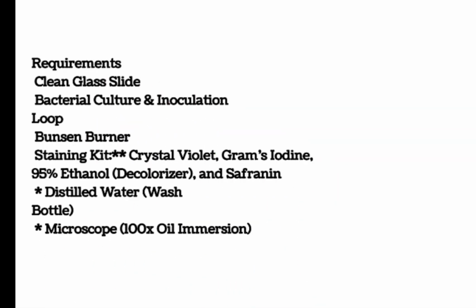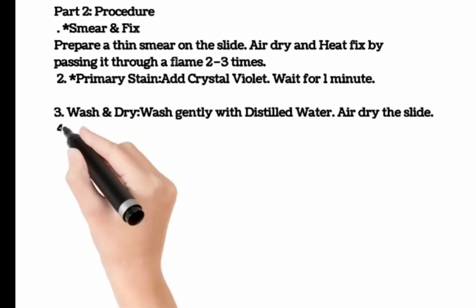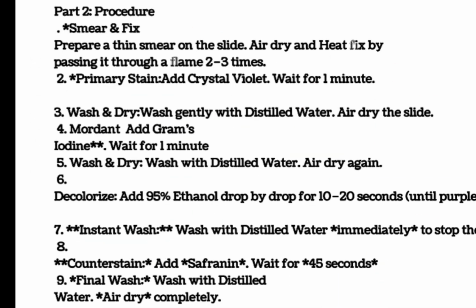Inoculation loop, Bunsen burner, staining kit, crystal violet, Gram's iodine, 95% ethanol decolorizer, and safranin. Distilled water, wash bottle. Microscope, 100x oil immersion.